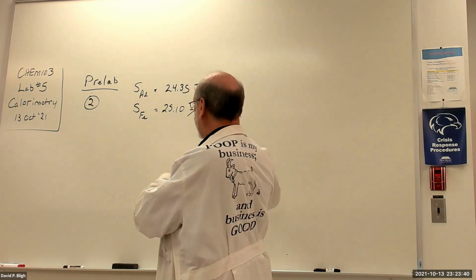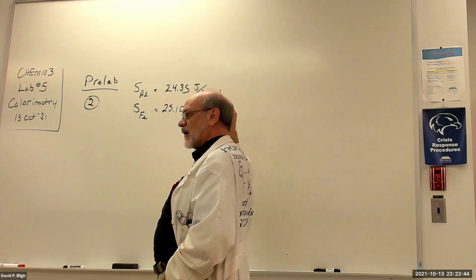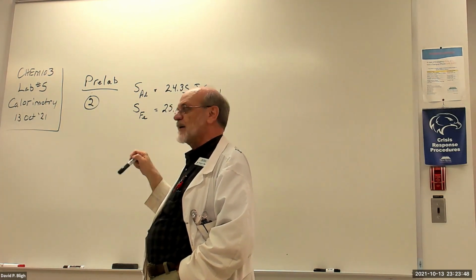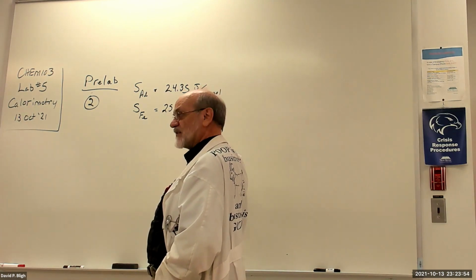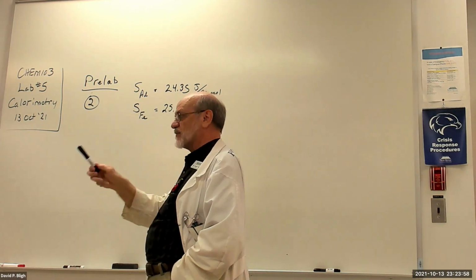Anyway, back to this one. You want to select the material that will change the least amount of temperature for the same amount of heat. And that's, you can put more heat into this one with less change in temperature. So that's why the higher value is the best.